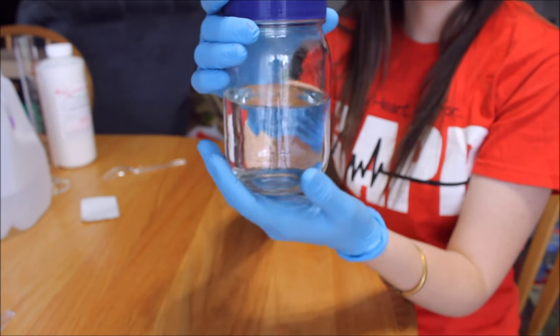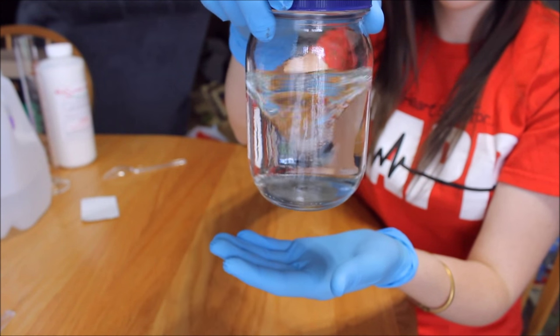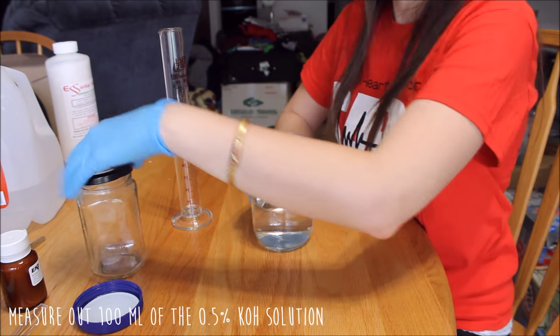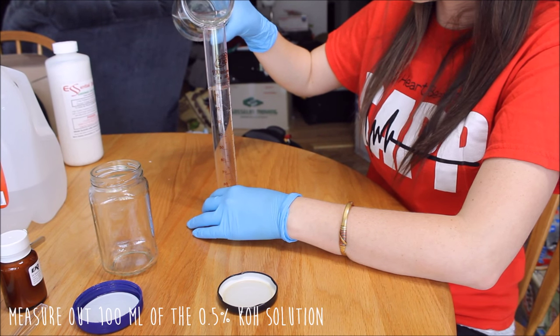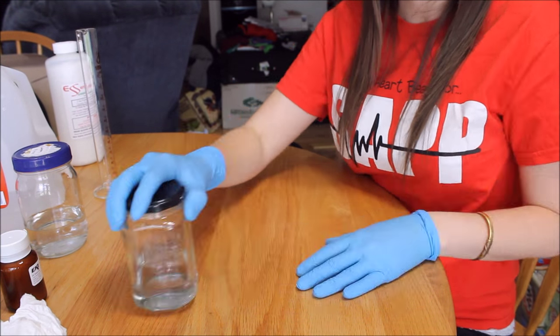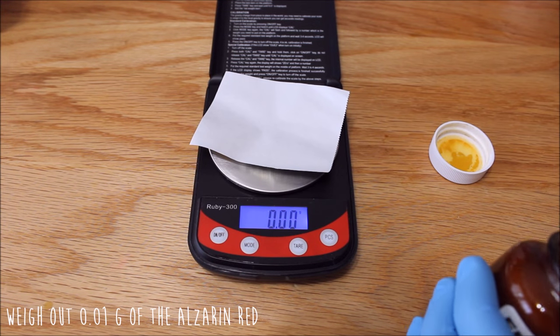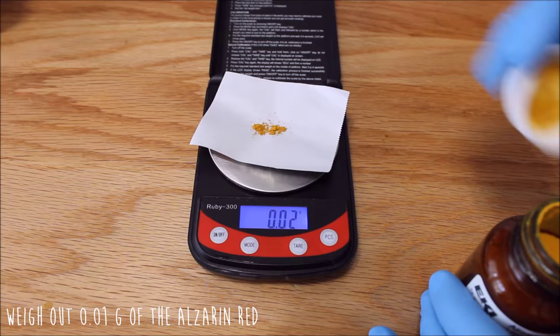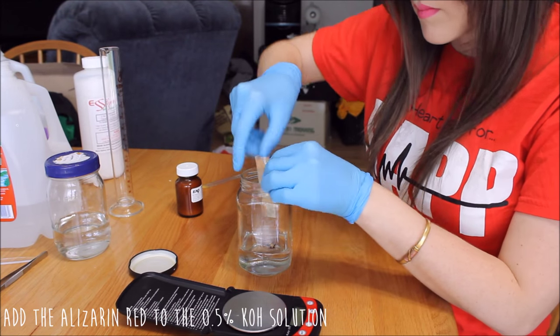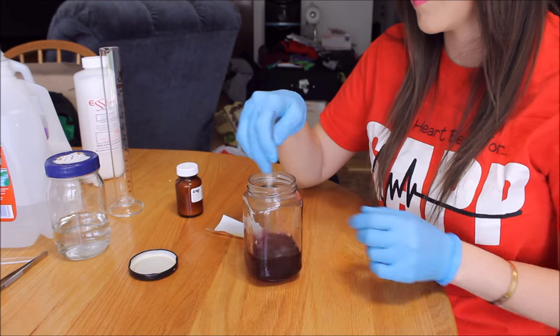After letting the potassium hydroxide solution sit for about 5 minutes, it became very clear. We've now mixed our alizarin red solution and it turned a purple color, as you can see.